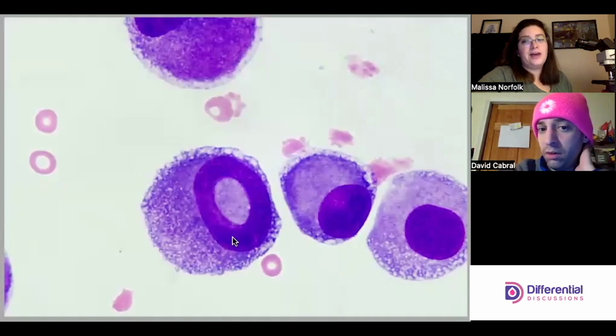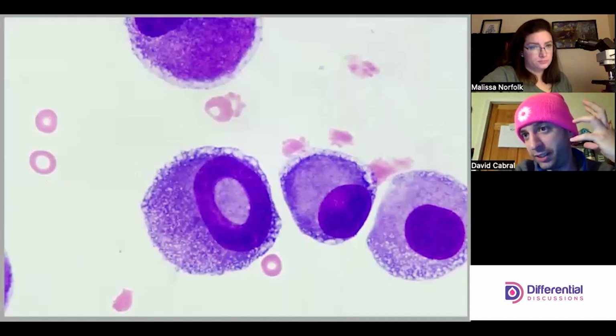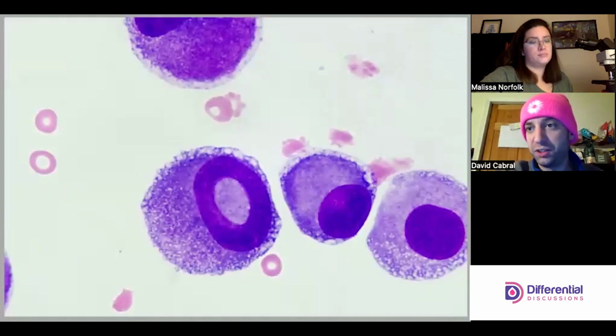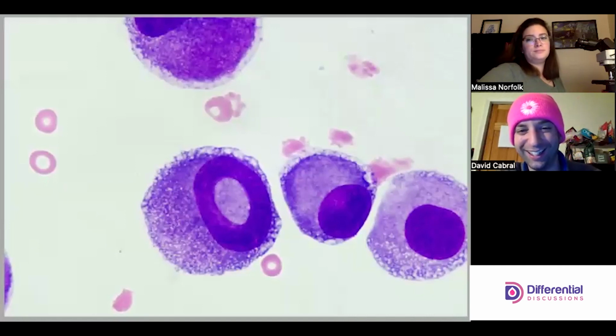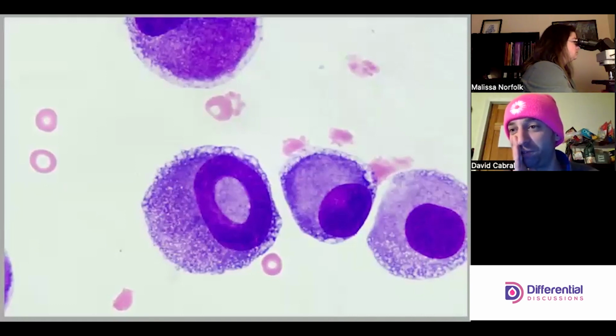And this one, if nothing else, if you don't notice the staining, this one should be like, what? Yeah, that's a big time what. So a ring nuclei, again, my knowledge base roots it back to dyspoiesis. I'm going to, by analogy, extend that right to these tissue cells. This is completely not normal to do this. Yeah, very bizarre. Beautiful. Oh, snap a picture. I already did.